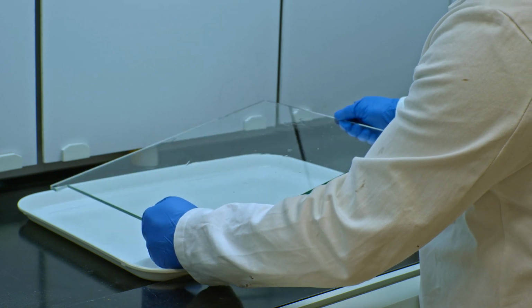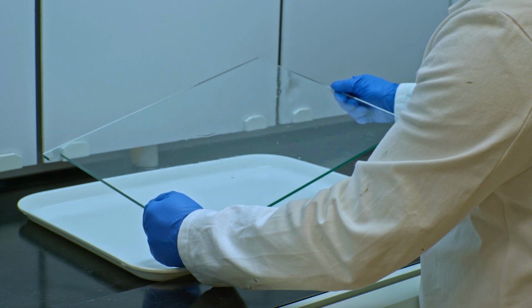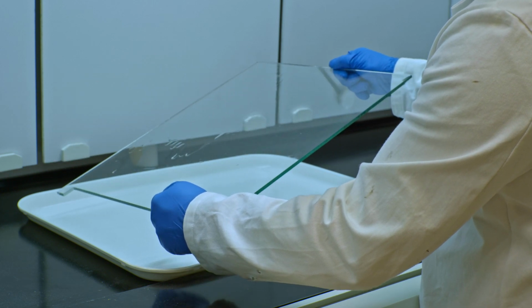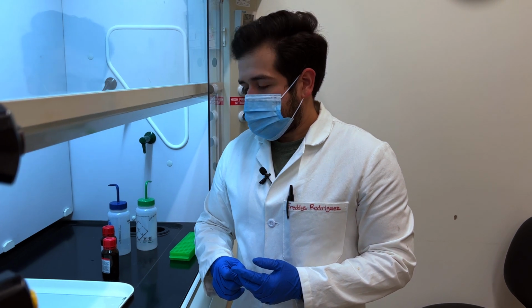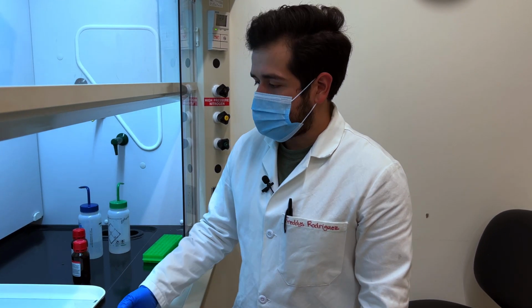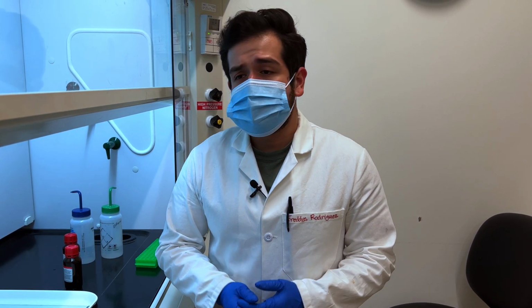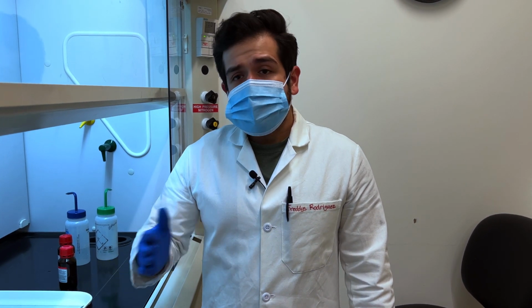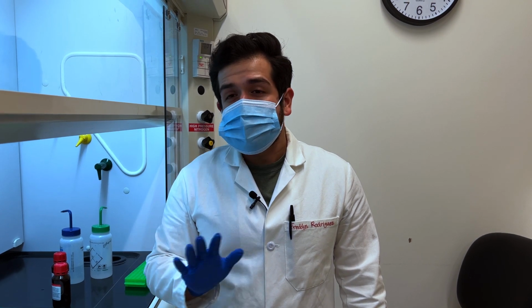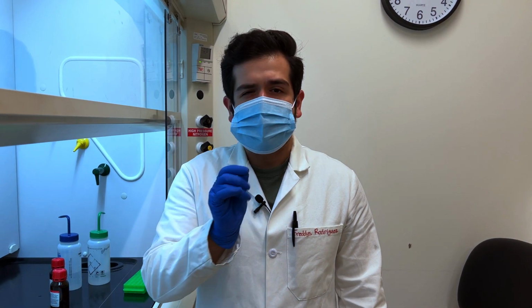Now the siliconizing reaction is almost instantaneous, and you can just start to wash it off as soon as you have placed the siliconizing reagent all over your glass plate. However, I like to leave it in the hood and let it dry up a little bit. It usually takes only about 7 to 10 minutes. The heptane solution that it's stored in goes off nicely, and the little gaseous hydrochloric acid that's produced can get off into the vents of the hood.